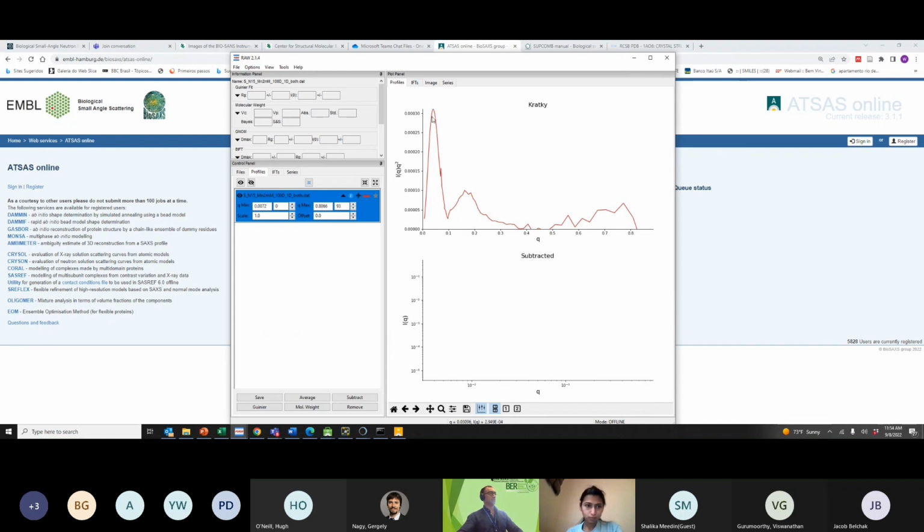So this is the most important one, which tells you the shape, it's more globular. So that goes down. But then you see the way it goes to the high Q. If you don't have the oscillation, probably our data here, you'll be going down to 0.04.